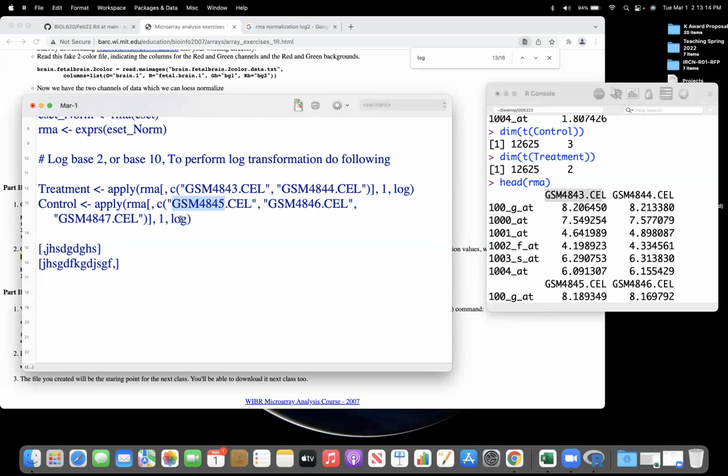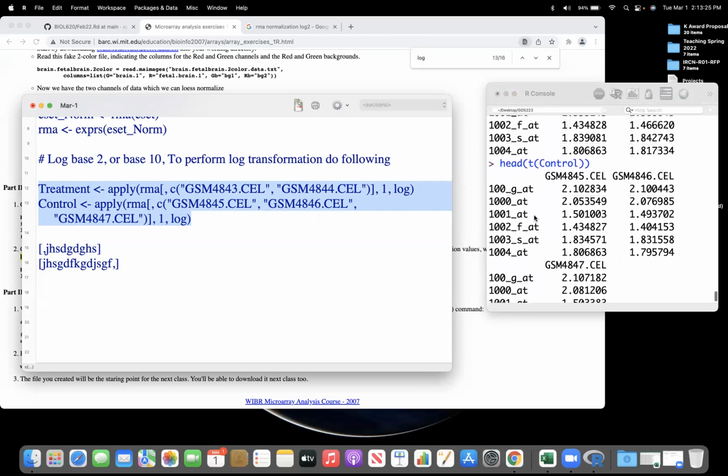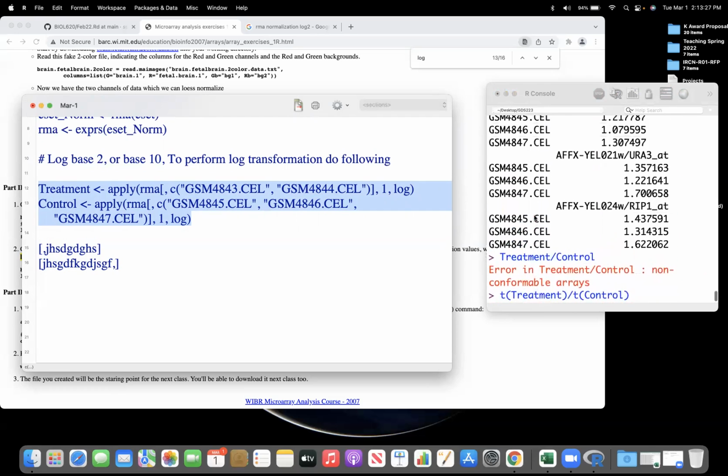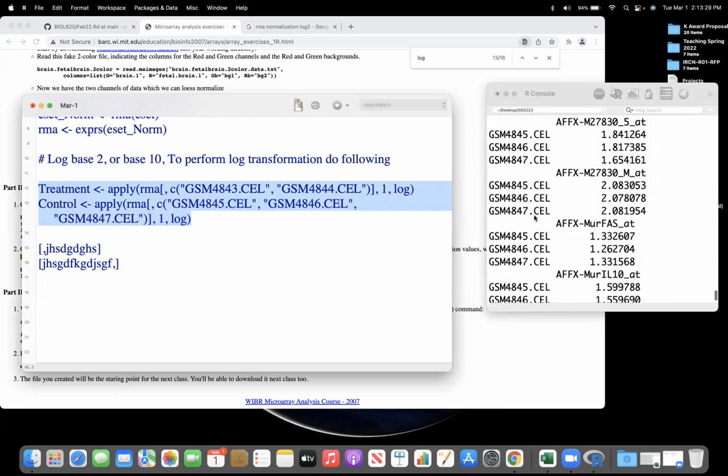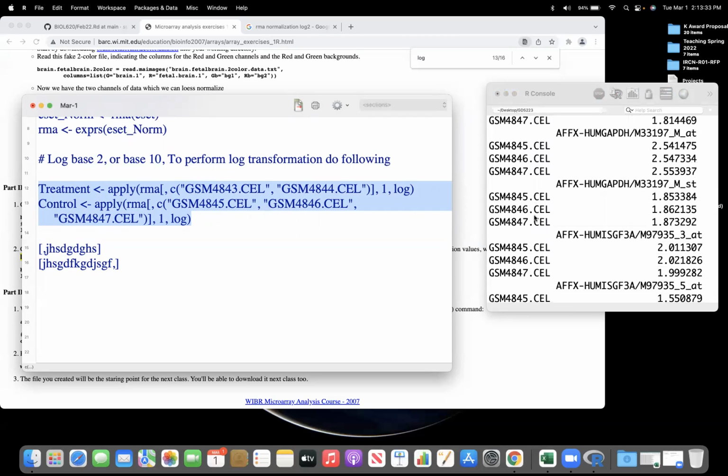We're good so far. Did you run these two statements? Do you have any questions? I was just testing a few things. What do you want to see? Okay, so when we put it in the console, we just do the treatment part first. Yes, you do that.